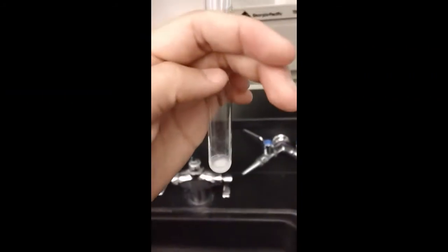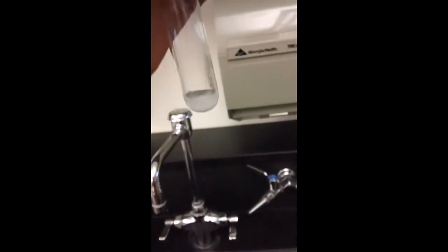Now I'm looking at my ZN. I need to remove my solid from my liquid. Alright, so coming back, this is my solid, and there's a little bit of liquid in there, so I need to take out a little bit more of my ZN. And again, I'm using 2 hands to try and hold everything here, so sorry if you can't see this in process. Okay. So now here I have basically my solid at the bottom, and this is ZN.